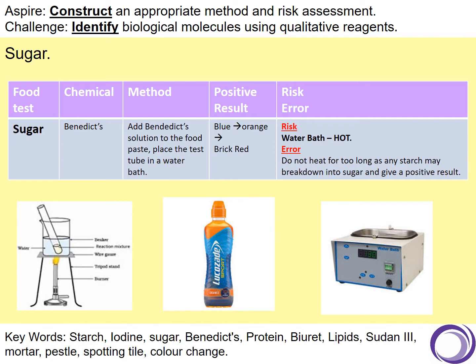If we're talking about risk assessment, that water bath can get really hot. I can turn it up to like 95 degrees Celsius and leave it there. So the risk is the water bath gets very hot. How to control it is just don't leave it in there for too long, and then you'll be okay.